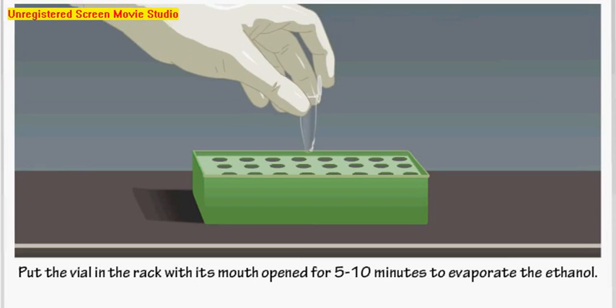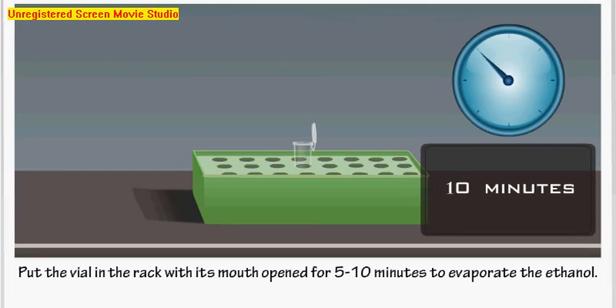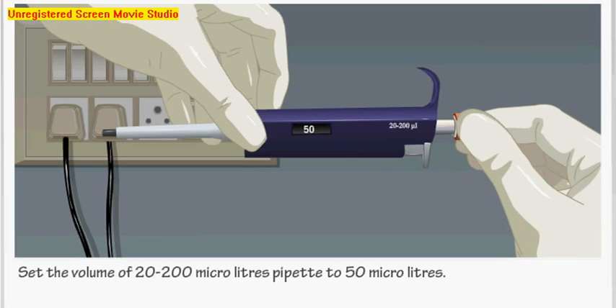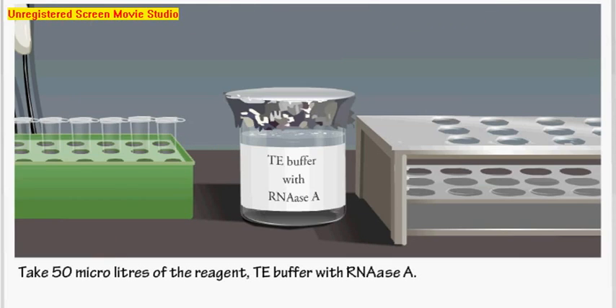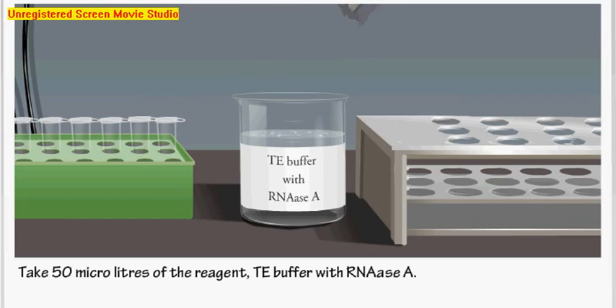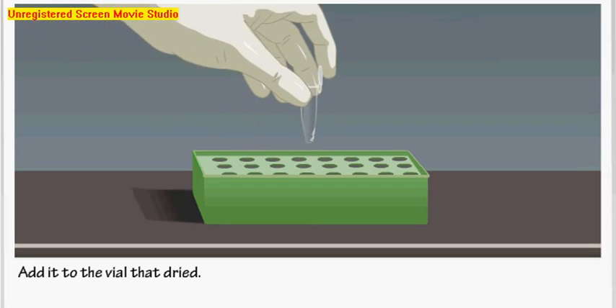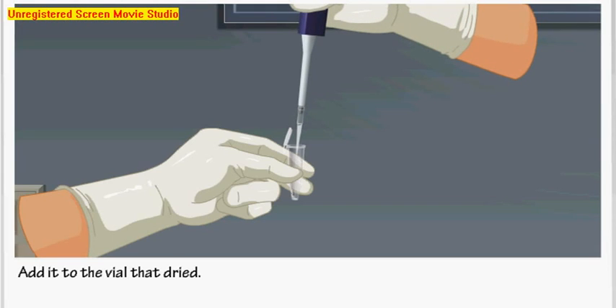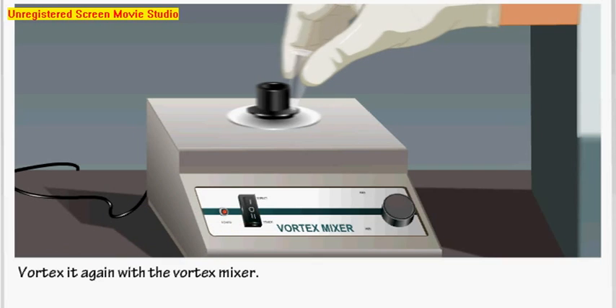Set the volume to 50 microliters. Take an appropriate pipette tip and take 50 microliters of TE buffer with RNase A. Add it to the dried vial and vortex it with the vortex mixer. Finally, detect the plasmid by performing agarose gel electrophoresis with a suitable marker.